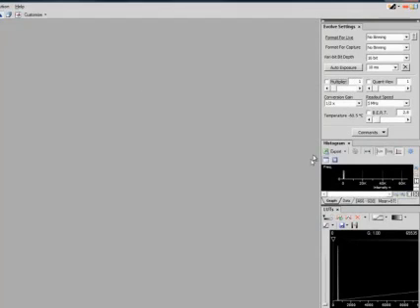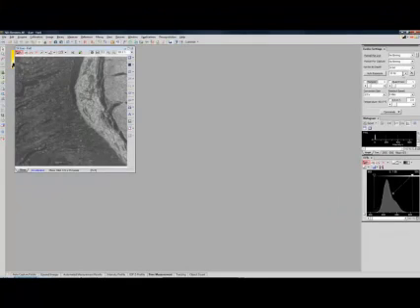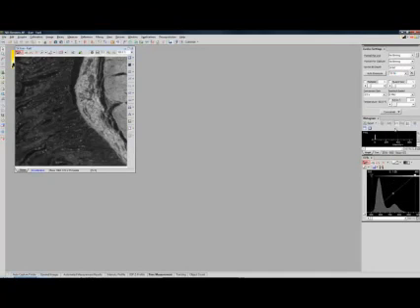Okay, and I will just click on my histogram to look at the best fit. Here we are, we're looking at a low signal. So I can control my binning and I can control my bit depth if I want to. I can also maybe give this say 30, maybe 50 milliseconds of exposure time, so I get my image up nice. Now this is currently operating in non-EM mode, because multiplier is not ticked. And I have the gain here, and the gain refers to electrons per grayscale. So I'm going to switch on the multiplier.